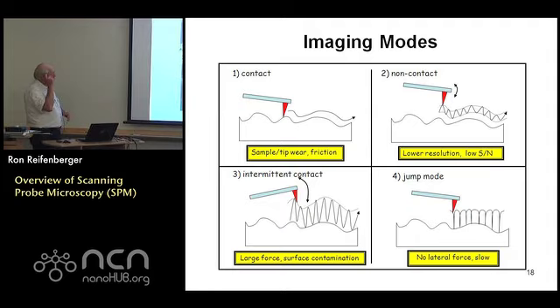So I'll just end by showing some typical images. I just went to the web and pulled off some different images. I have an example from electrical engineering. So this is a little island of material, and these are gates, source, drain, and gates, and they're trying to pass electrons through this island. And what they wanted to do is image the topography of their device with an AFM. So these are the different electrodes, gate electrodes, guard electrodes, the source and the drain. So this is an application from electrical engineering.